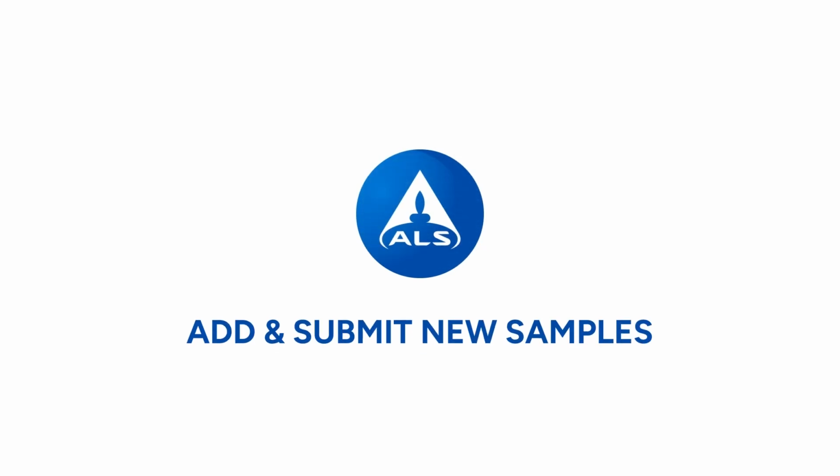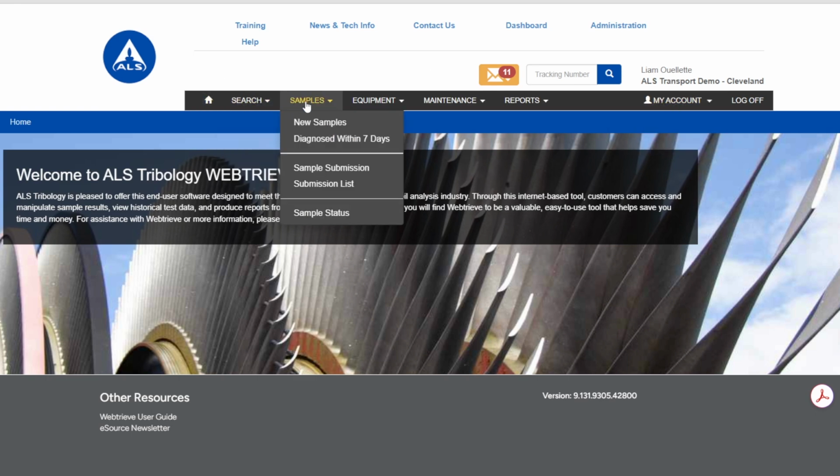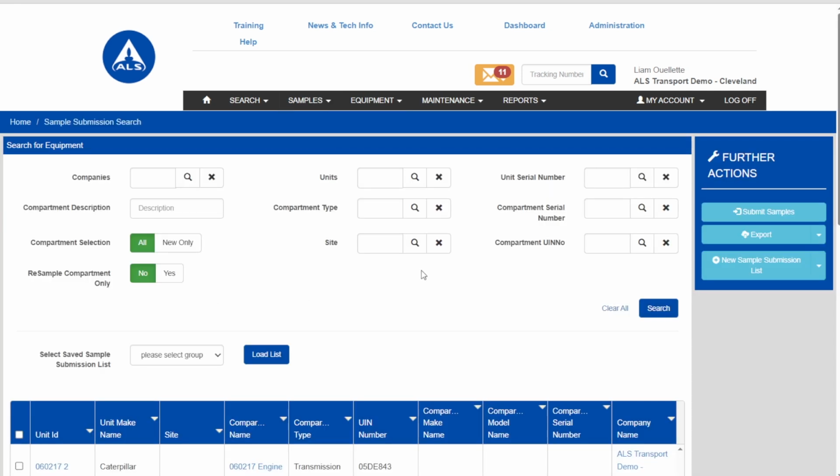In this video, I'm going to show you how to add and submit new samples on desktop. After you log in, you can go to the top level navigation under the Samples tab. You can scroll down to Sample Submission. Click that. This will bring you to the Sample Submission search page.